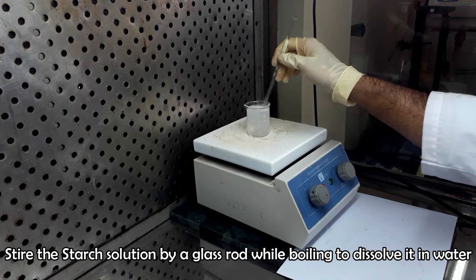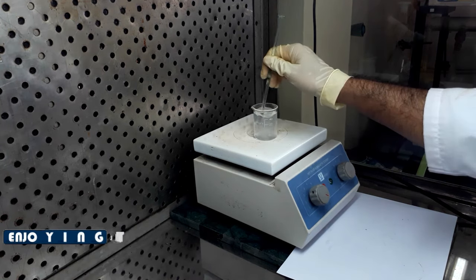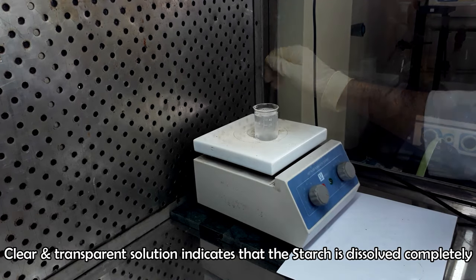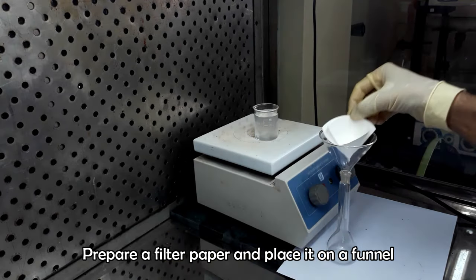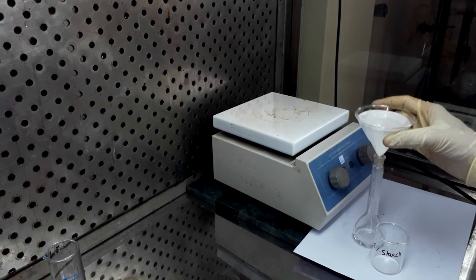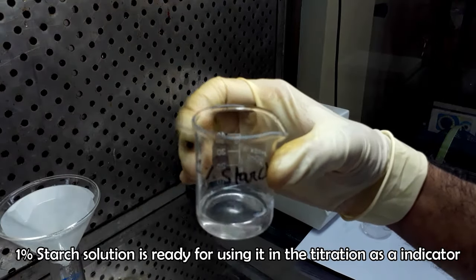Stir the solution with a cleaned glass rod while boiling to dissolve the starch in water. Clear and transparent solution indicates that the starch is dissolved in water completely. After dissolving the starch, filter the solution immediately using a filter paper. Collect the filtrate and use it in the test as 1% starch indicator.